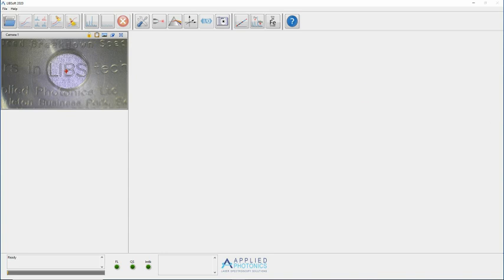To hide a video display window completely, click on the X in the title bar of the window. To re-show the video display window, click on the camera configuration button in the main LibSoft toolbar and tick the corresponding Show Image checkbox.